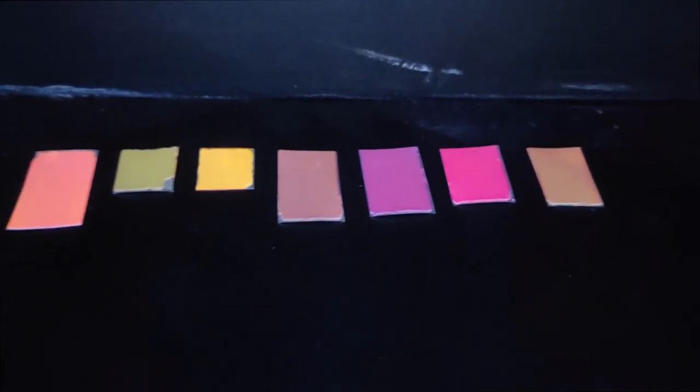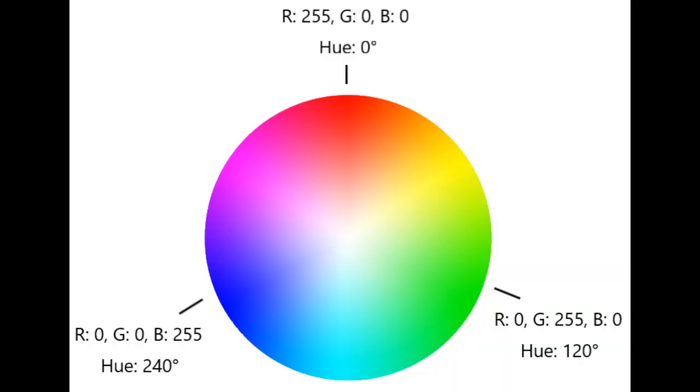But there is an important point. Amines with very similar structures can cause similar color changes. So, how can we distinguish these subtle differences that the human eye cannot perceive? This is where digital image analysis comes in.